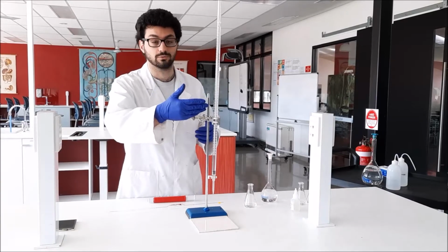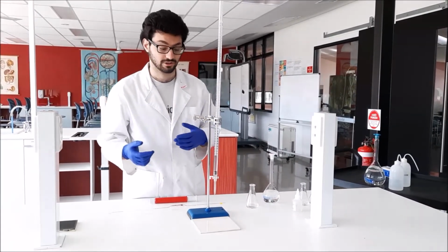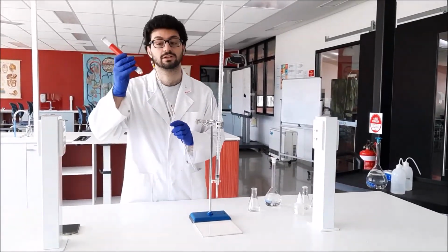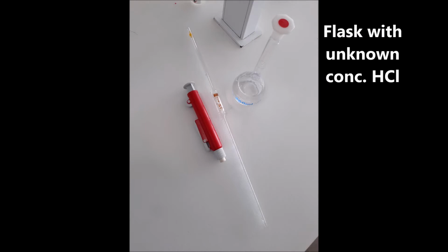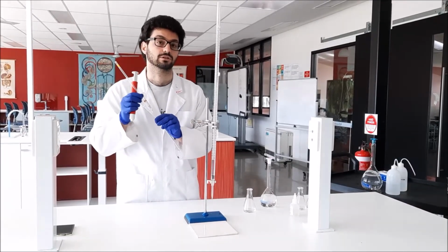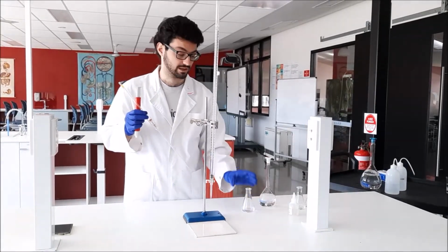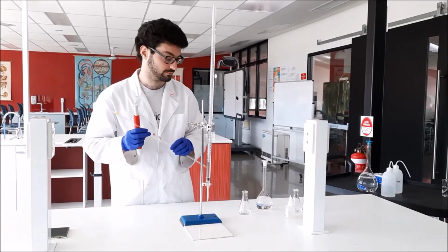So we've got our burette, and inside our burette we've filled it with 0.1 molar sodium hydroxide. We've also got our pipette and our pipette filler. This is designed to help suck up the solution to exactly 20 ml. So we're going to put 20 ml of our hydrochloric acid inside our conical flasks, so we can have 20 ml in there and titrate it with a known concentration of our sodium hydroxide.